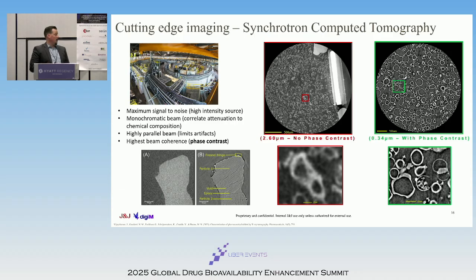And then the example on the right is comparing a standard resolution lab-scale image of a bed of spray-dried particles. Again, this is just a single 2D slice in a 3D volume. But if you zoom in on a particle, you can see how much clearer and crisper it is at a higher resolution. But even at the same resolution, you get much better edge detection and a much clearer picture. So this will allow for much more advanced image segmentation.